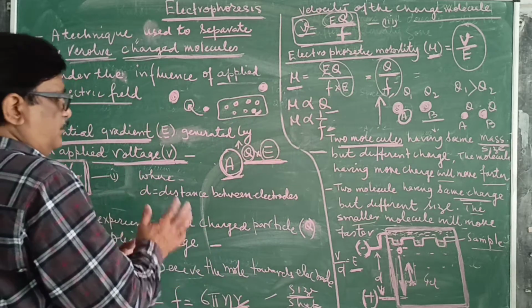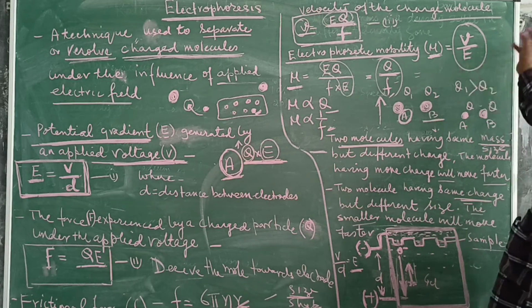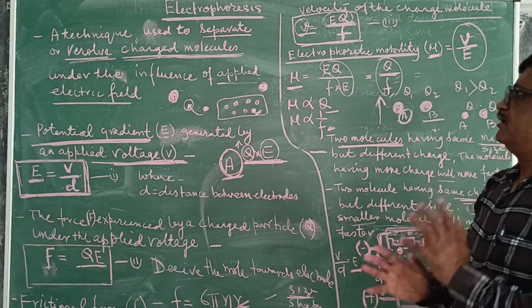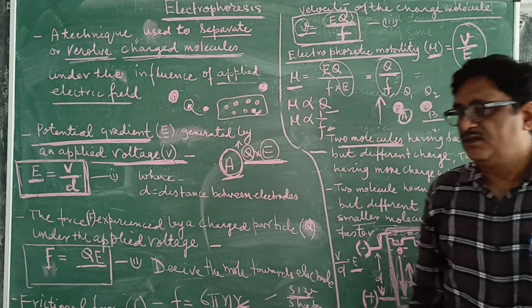In this way, by differential movement due to difference in charge or difference in size, the two molecules can be separated through electrophoresis. This is the basic idea of electrophoresis.